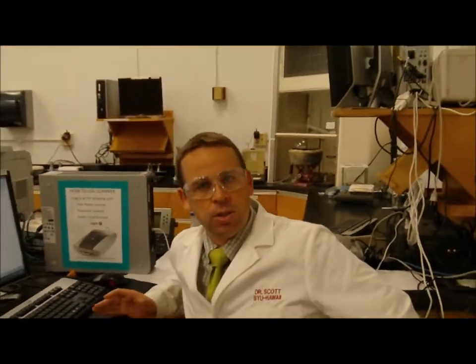So that is the process to determine concentrations of unknowns. Now, if I had a different concentration of a copper sulfate unknown, I can use this plot here and just put it into the spectrophotometer, determine the absorbance at 810 nanometers, and I would be able to determine its concentration right away. So that's how you determine the concentration of an unknown using a spectrophotometer with a standard curve.